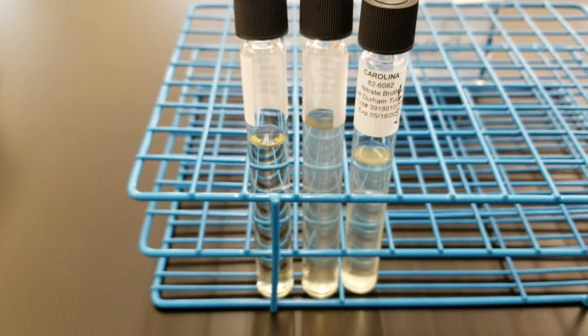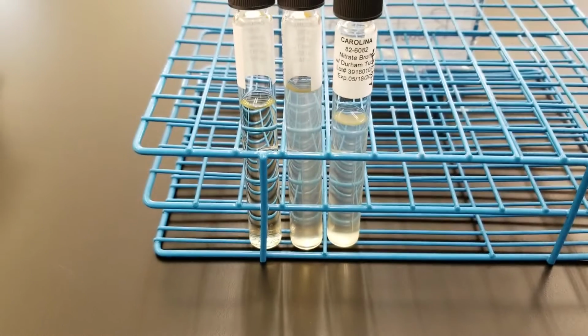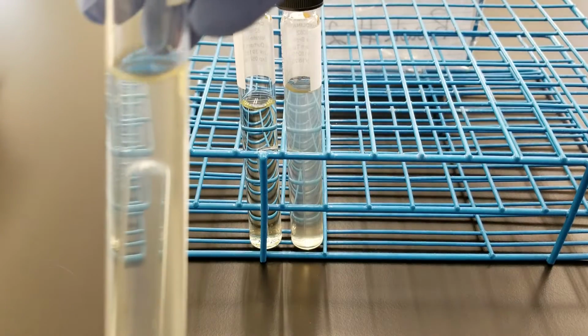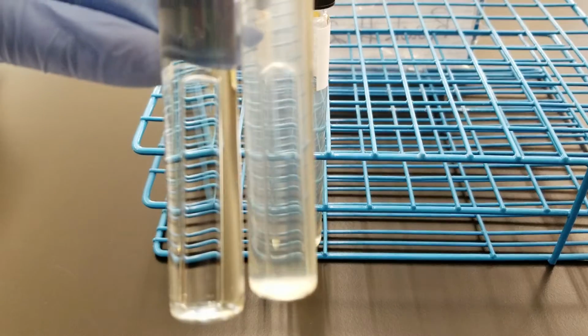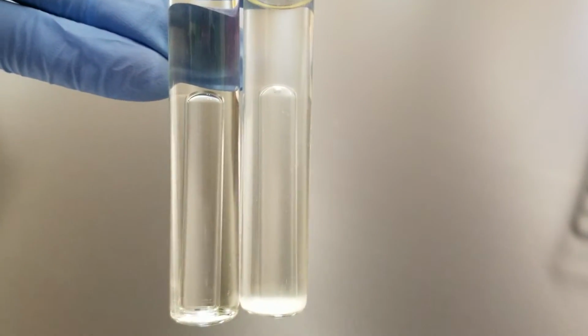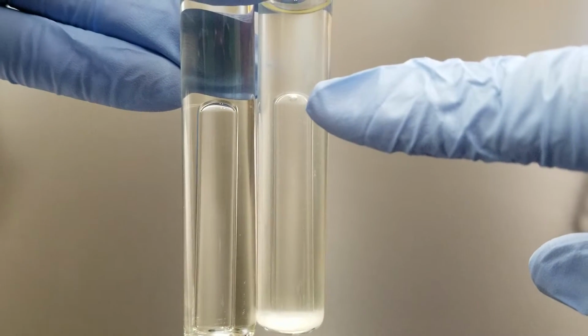Okay, so we're back, and we did our 24 to 48 hour incubation period. We did 48 hours. You can notice that there is growth in the tube of each of them because they're cloudy as opposed to the uninoculated one, which remains clear. There is a little gas production in the Moraxella tube here, okay?